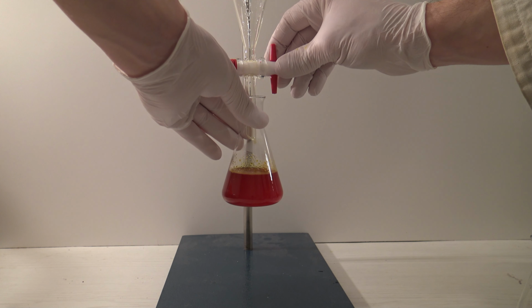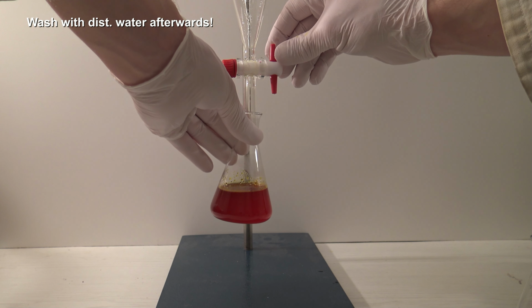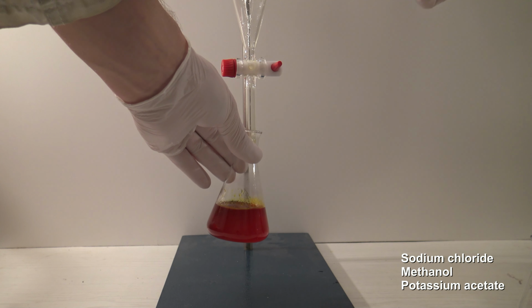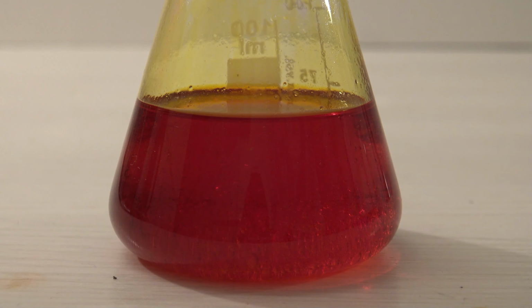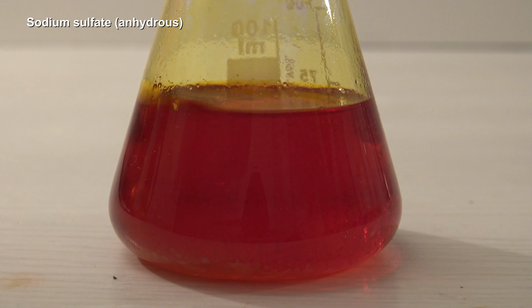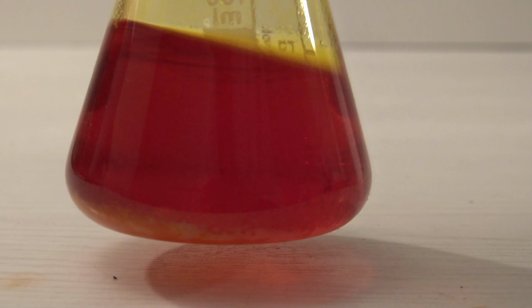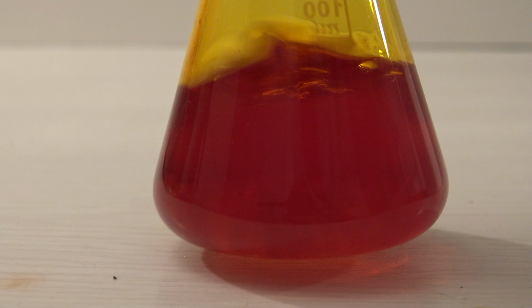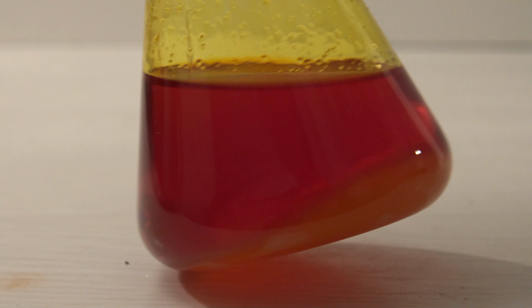Here a mistake was made because the organic layer had to be washed with water to remove water-soluble traces of sodium chloride, methanol and potassium acetate. Then the organic layer was dried with anhydrous sodium sulfate and left overnight. The amount depends on a lot of factors, which is why usually enough sulfate is added until it doesn't form lumps and flows freely. Also the movement as in a snow globe is a good indicator.